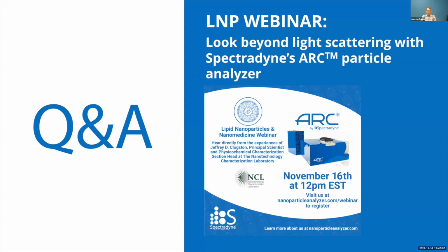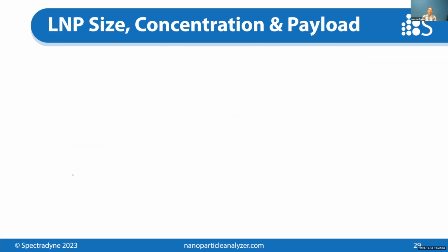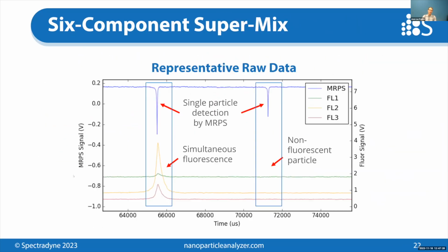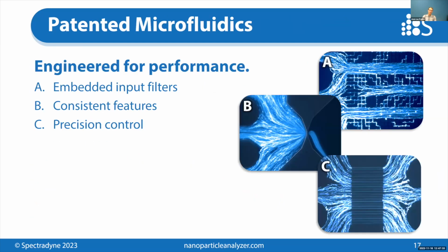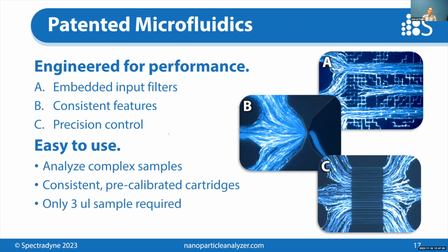Fabio, another question. How large are actually the pores of these different cartridges? Okay, and the follow-on to that is, how do they clog, right? So let me show you that one. With the TRPS, this is a different implementation of the resistive pulse sensing technique. Those instruments are made by a different company. They do suffer a lot from clogging.